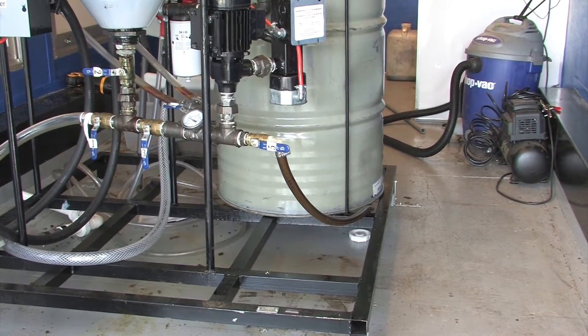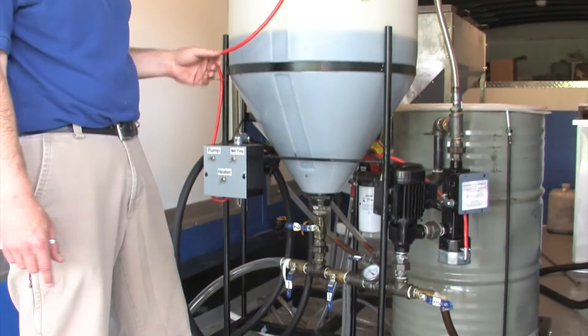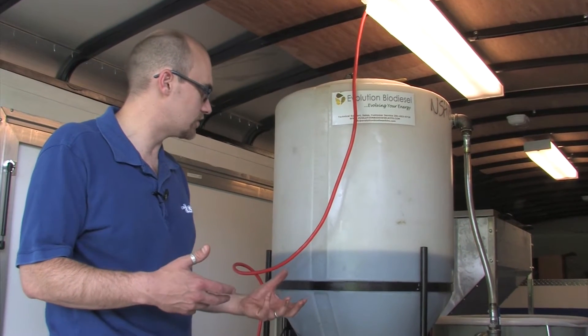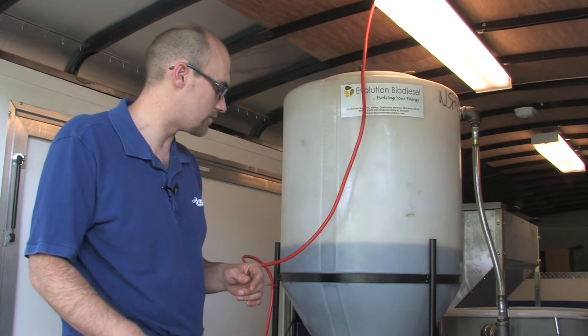What we've got already in the tank is about 20 gallons, and 20 gallons is essentially a half batch. That's going to be enough for what we're going to do right now for the de-gumming and then later on for the biodiesel process.